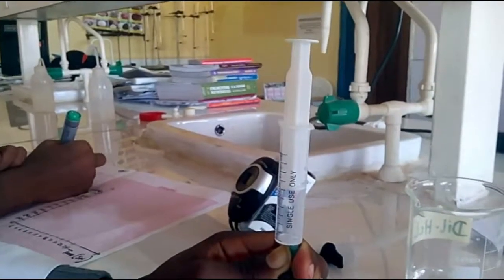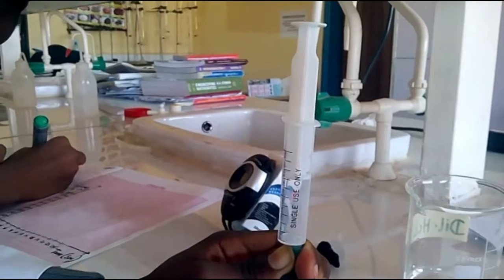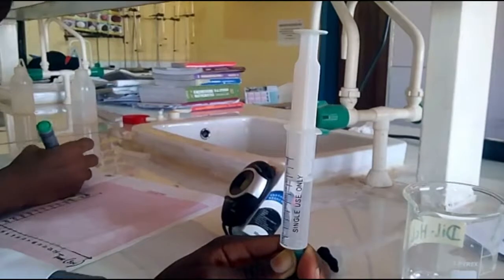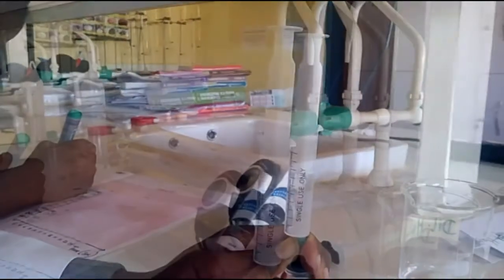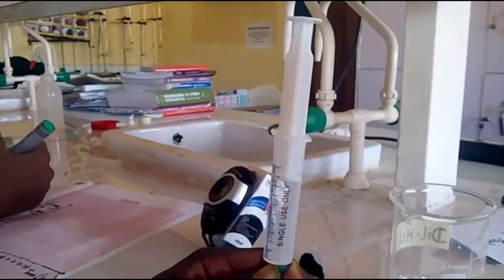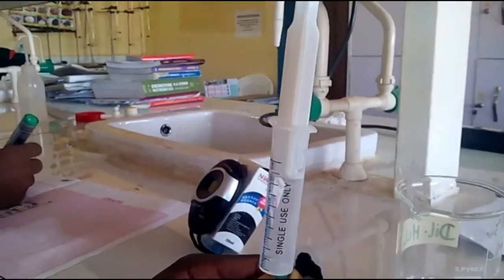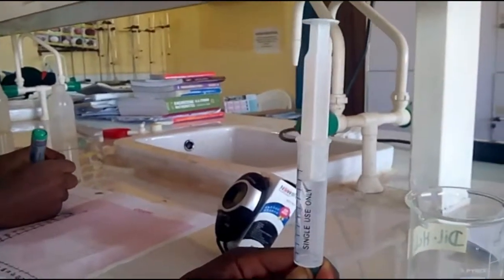The rate is not uniform over the whole reaction. The reaction rate is highest at the start of the reaction and decreases gradually with time, becoming 0 when the reactant is completely used up. Now our reaction is complete.